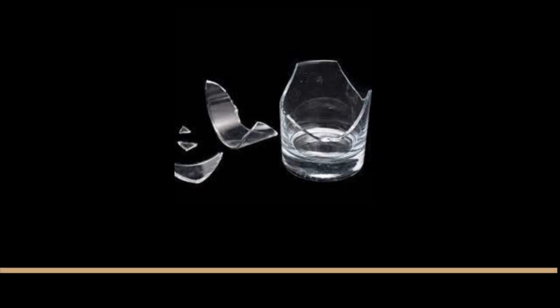If it is a broken glassware and you are cut, allow the wound to bleed and wash it with warm water and soap. Seek medical attention as soon as possible. Make sure the glass and elements spilled are immediately cleaned up.